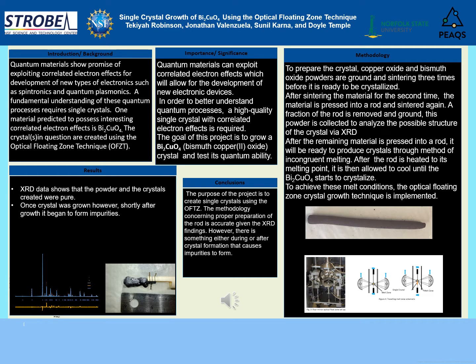Today, I will be discussing the growth of single crystals using the optical floating zone technique. The objective of this project is to grow high-quality, non-symmorphic single crystals and determine their effectiveness as a new quantum material.